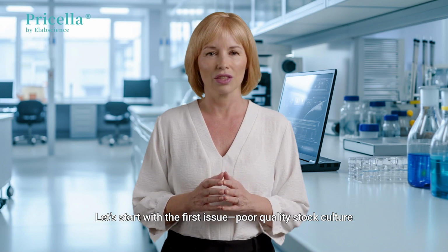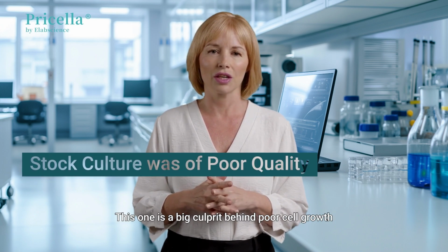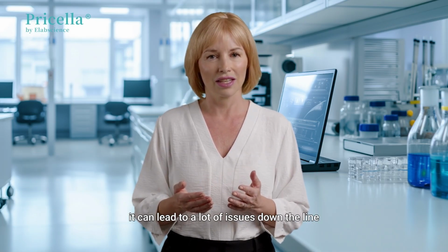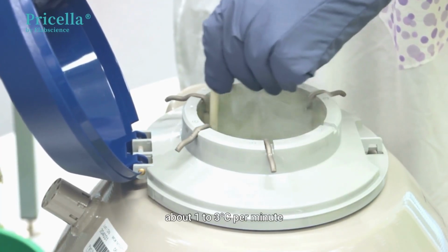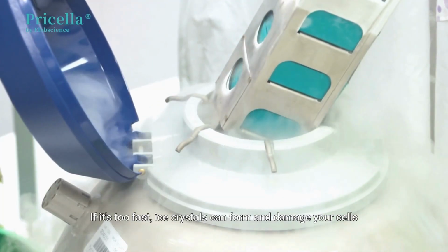Let's start with the first issue, poor quality stock culture. This one is a big culprit behind poor cell growth. If your stock culture wasn't frozen, stored, or thawed correctly, it can lead to a lot of issues down the line. For example, when freezing your cells, you need to ensure the freezing process is slow, about 1 to 3 degrees Celsius per minute. If it's too fast, ice crystals can form and damage your cells.